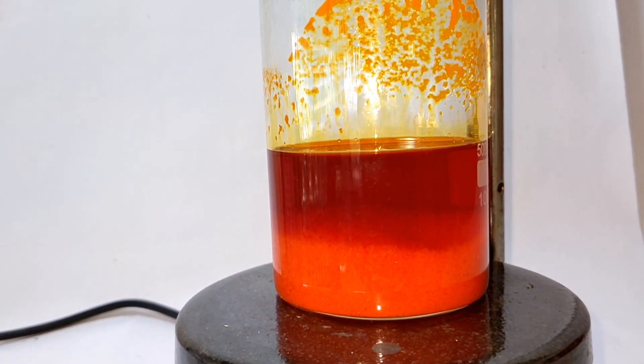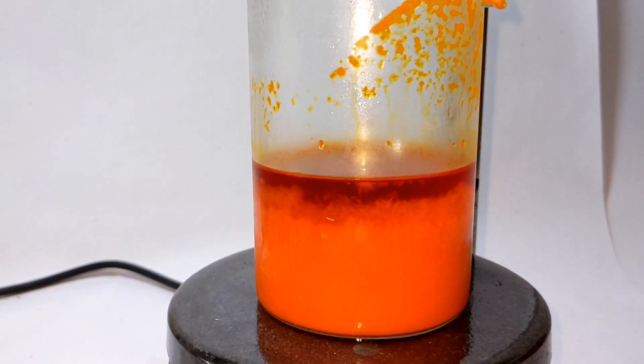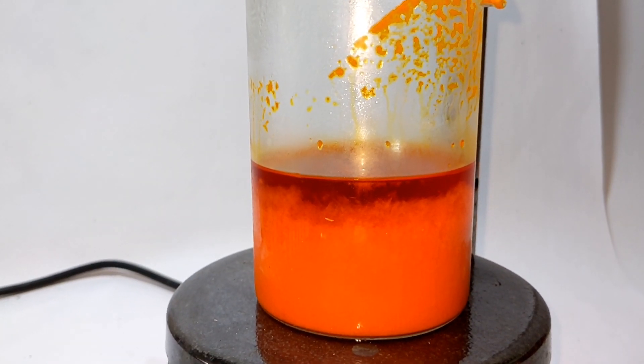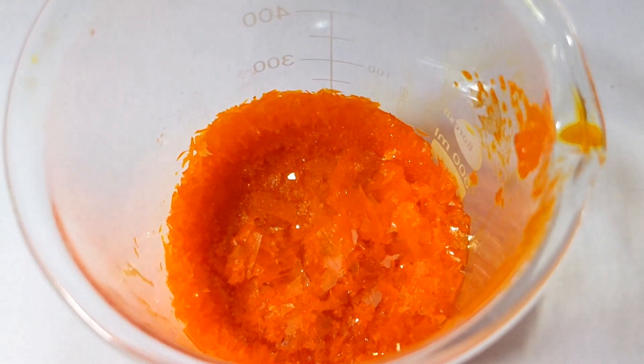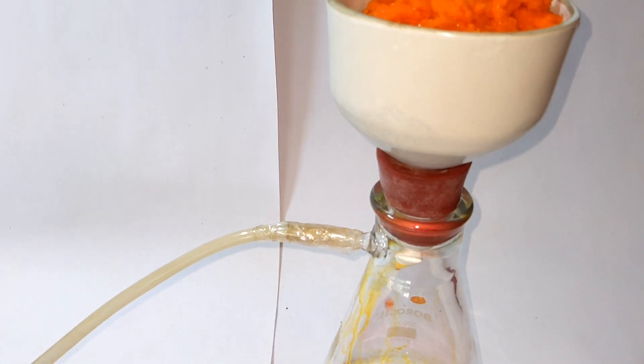The beaker was then placed in a refrigerator overnight, and the next day you can see a lot of crystals of pyridinium chlorochromate have formed. The supernatant solution was drained off and the crystals were then vacuum filtered to obtain the final product.